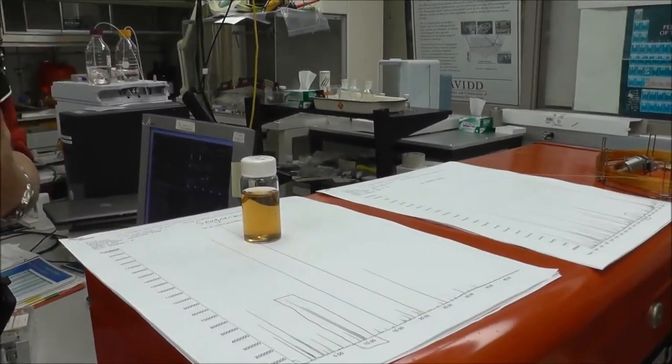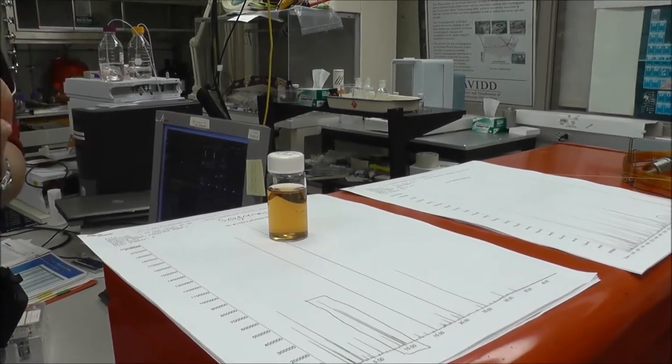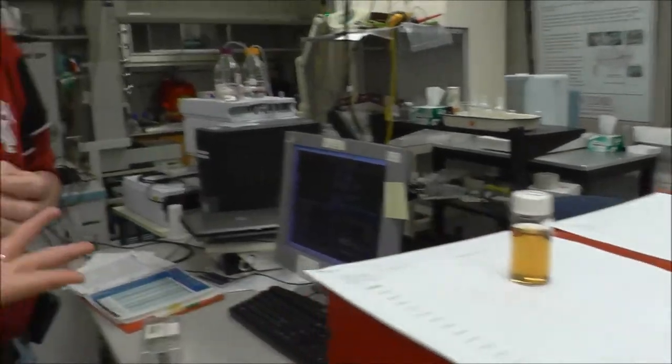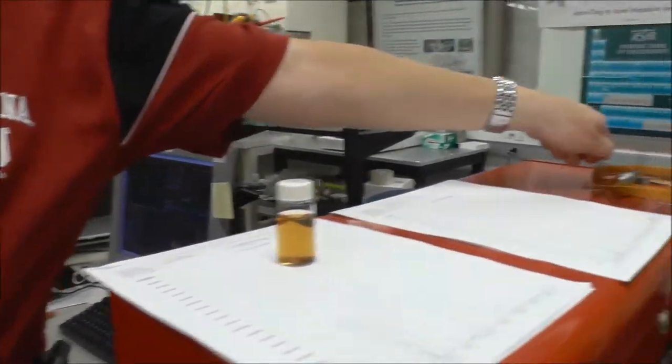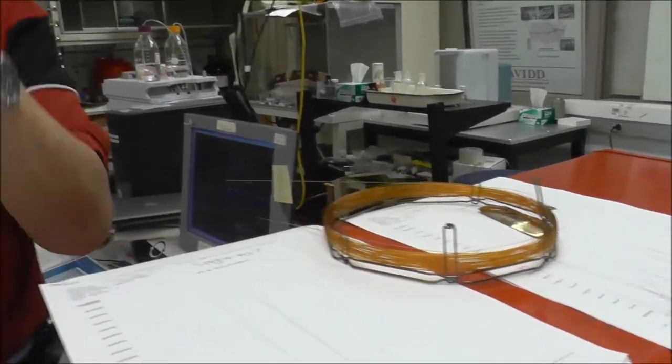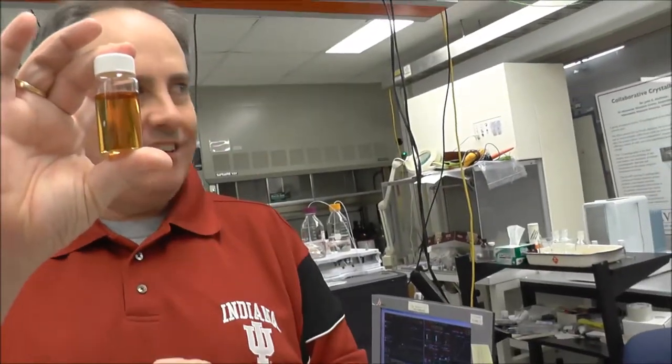And they want us to look at whiskeys to figure out what components make them taste good, especially as they go and make the rum. So we do that by gas chromatographic mass spectrometry. We take the whiskey and extract out the good tasting stuff.